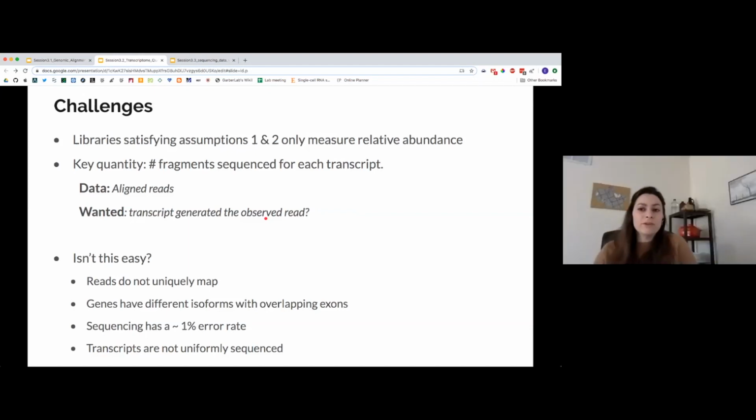Right. So you can never, even though you know a lot of the biases that happen, a lot of the losses that happen during library construction, and, for example, the number of cells that you put into the experiment, you cannot guarantee an exact approximation. If you're sequencing from a pool of cells, and even with single cell, you have losses during the library preparation, and you have these biases that will cause different transcripts to be captured differently.